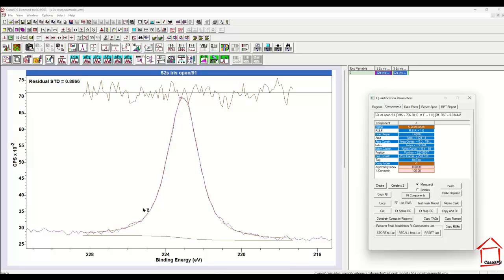I have to manually adjust the offsets at the start and end because I've chosen a specific start and end and a given intensity that my background starts at with respect to the data. So this is all adjustments that are required to try and use a line shape that is sympathetic to data.